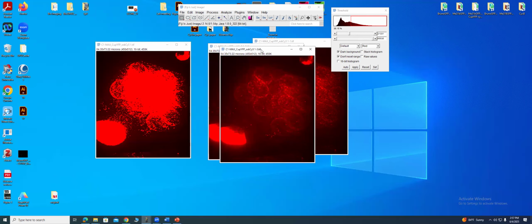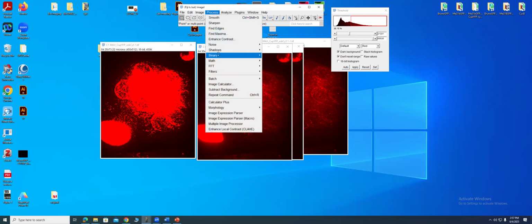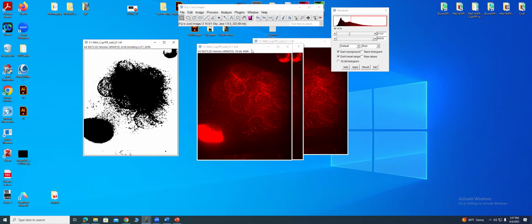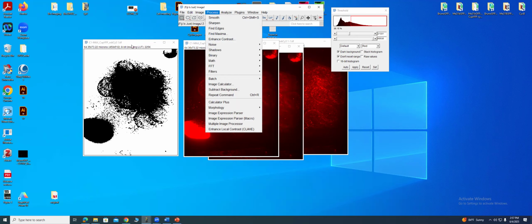So we're going to do that for now. We're just going to invert. Let me just see if I use this and I make this binary, what happens? Inverting lookup table. Yes, so then it inverted it. I'm not sure why, when you do it automatically from here, it's not giving us the inverted lookup table automatically.